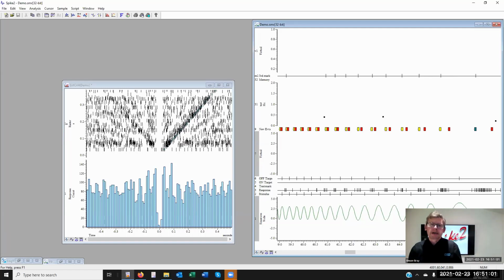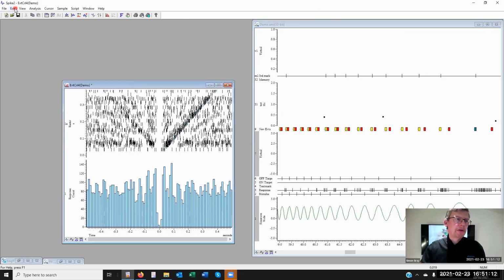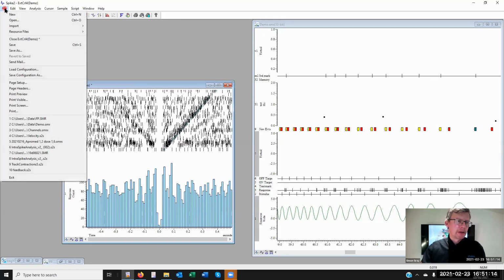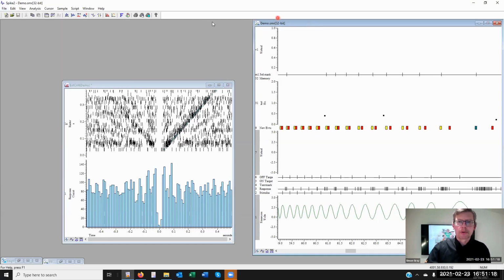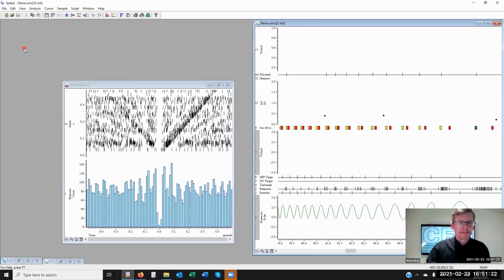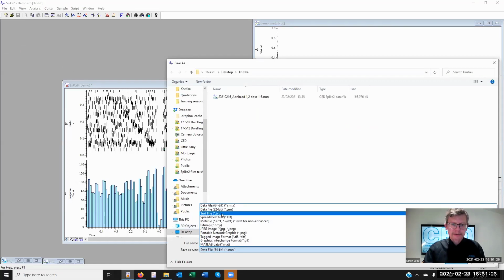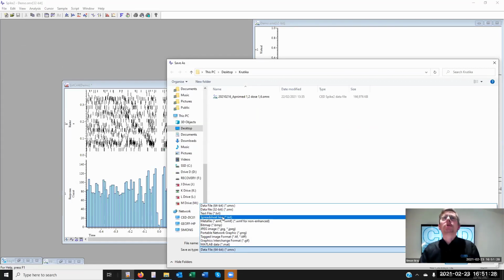If you're creating a measure to channel function, so yes, measure to channel, you could then use file and then, let's click on the right window first, file and export as. And here we have options for text file and spreadsheet. Normally spreadsheet would be the one that you want.